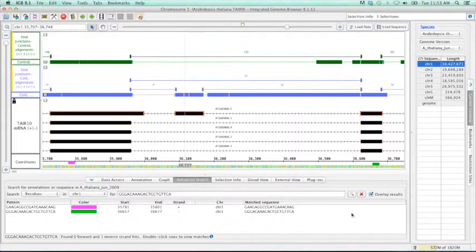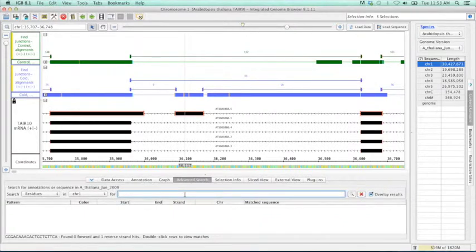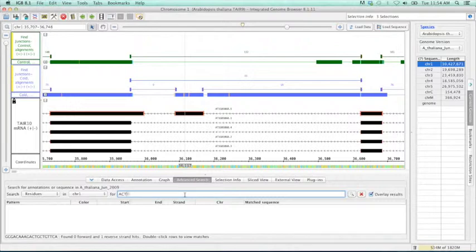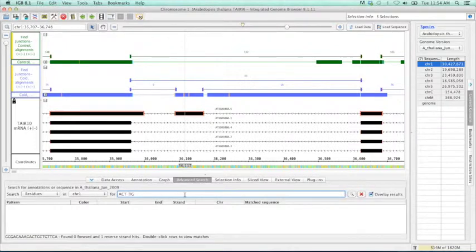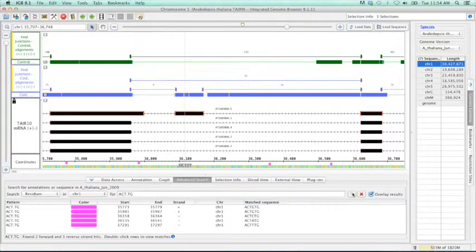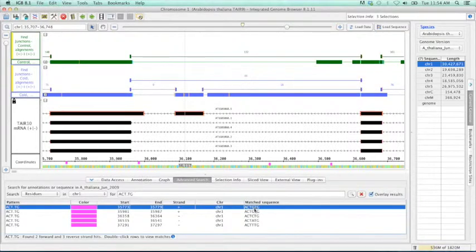For instance, let's say we wanted to search for a motif. And we know that that motif starts with ACT and ends with TG. But in the middle here, it could be anything. So in IGBI, if you use a period, this represents any nucleotide. So if we go ahead and search for this, we will see that the pattern here, and that this can be anything, and it's found these very quickly.